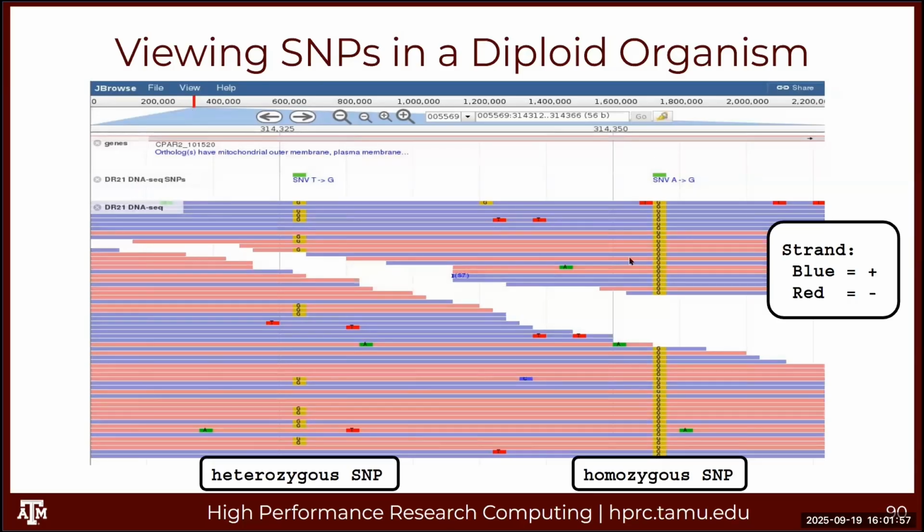That means we're viewing a region in this red bar in this version here. See how it's kind of expanded. If there's a gene right here, there's a gene we already know about in the reference genome. Here's our sample, we align to it. And here's our VCF file. So the VCF is the variant file. The variant file shows us that in this position, there's a SNP.